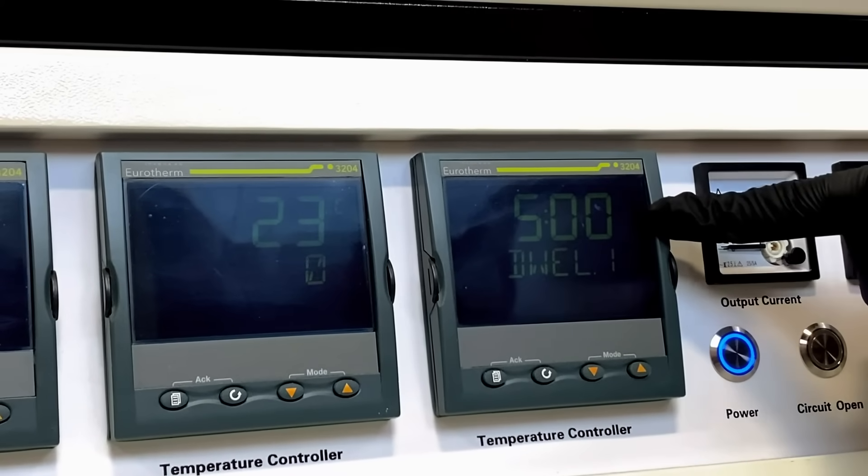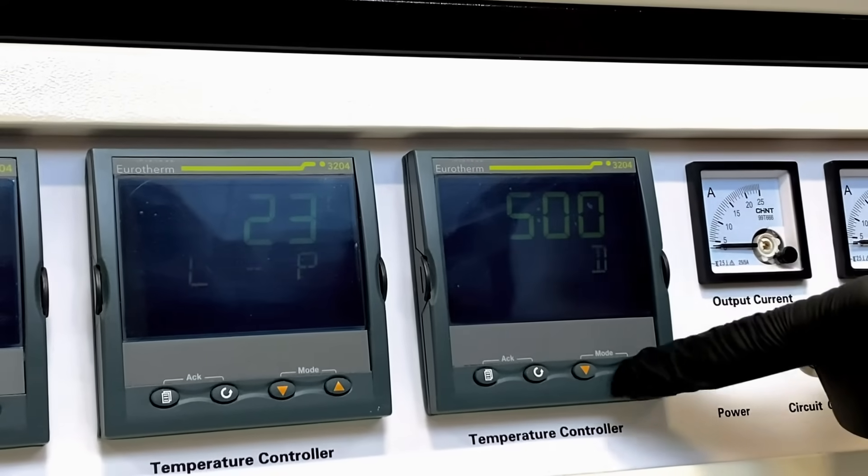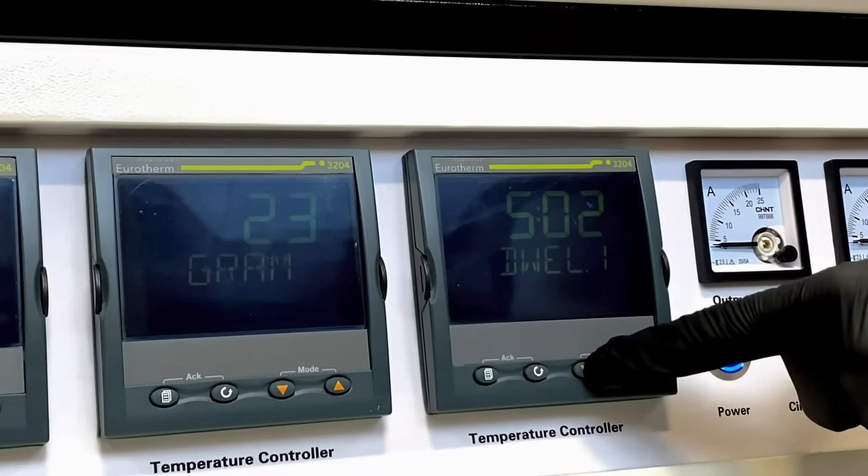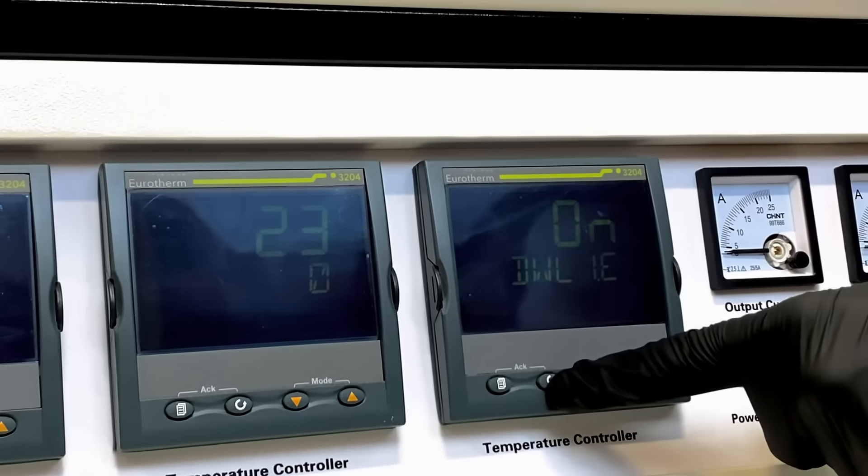And you may set the time at which your furnace will maintain temperature during the first dwell cycle. We will leave this at 5 minutes. Press the cycle button.